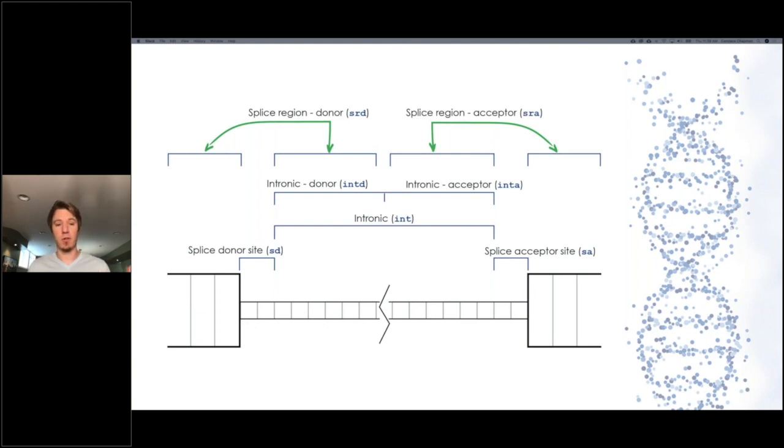And so there's the intrinsic relevance of a paper versus the relative relevance of the paper to the search that you are doing. When we calculate the relevance of the articles and prioritize them for your query, we're taking two different relevance calculations and combining them. We're taking the absolute relevance intrinsic to the paper itself, and we're taking how relevant the paper is to the thing that you searched.